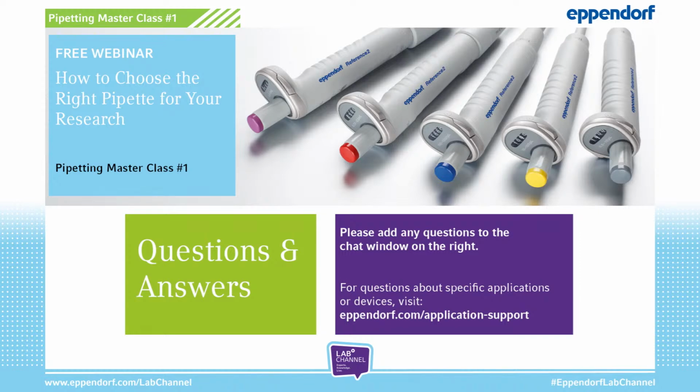However, for the accuracy, you have to make real measurements. It depends on what kind of way you can weigh the drops. This really depends on the equipment you have, but this would be the best way to check for accuracy when you want to check it also in between different calibration checks.